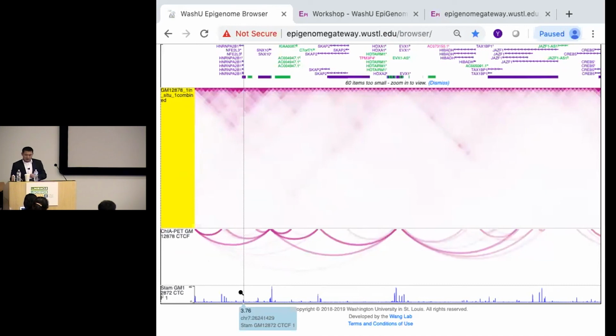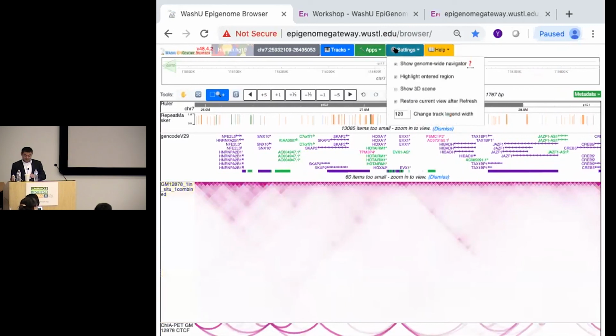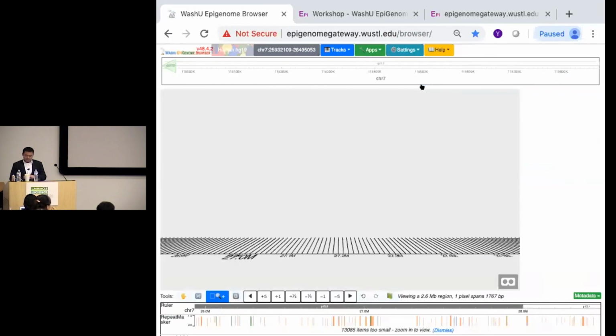So let's try one more thing. This might break, but this is where we want to do more development. That is the 3D version, right? So it's 4:30. We're getting tired, but I'll just show this one, and then we'll call it a day. Or I'm happy to answer questions, of course. I'm going to try this one. So click on the 3D thing. This one doesn't work that well yet. We're at the very beginning of developing this function.